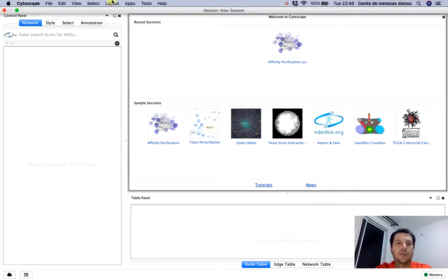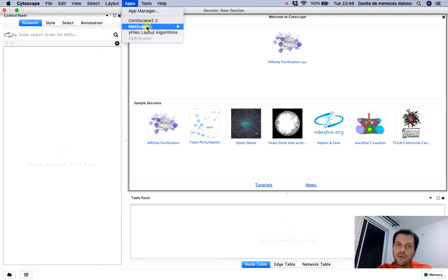And what we are going to do is I'm going to show you the basic things of Cytoscape, and then we are going to do a live demo, and I will give you some tips on how to improve the network analysis. Okay, so I asked you guys to install these four apps here. If you haven't done this, watch the last class about how to install Cytoscape.